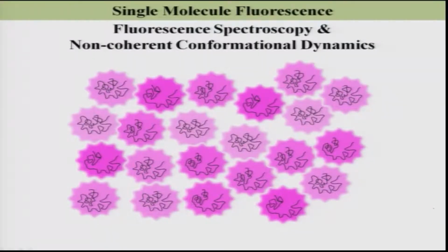Okay, I have to make it more clear to you, I have this PPT slide for you. Here you see, let us say this is my protein molecule, and in this protein molecule, the fluorophore is present in this location and the quencher is present at this location. So, when they are far apart, I can see a strong fluorescence, strong pink fluorescence, just as I have described. And when they are close by, as you see in this cartoon I have made, the fluorescence intensity is less.